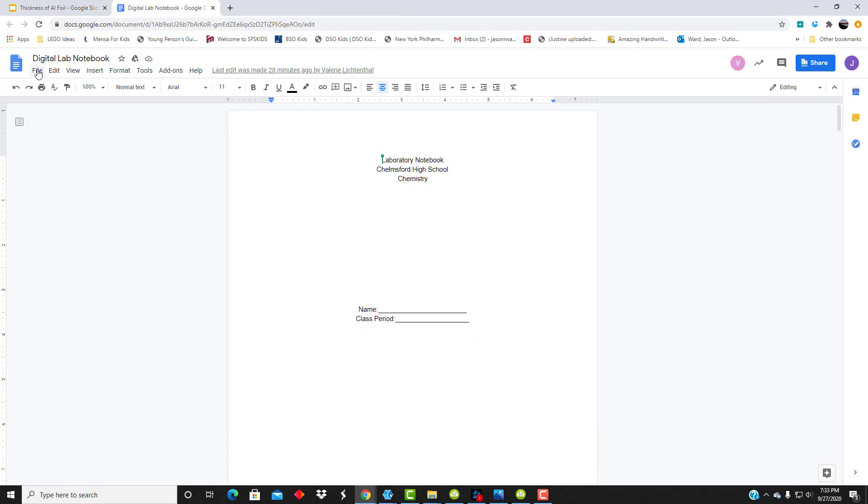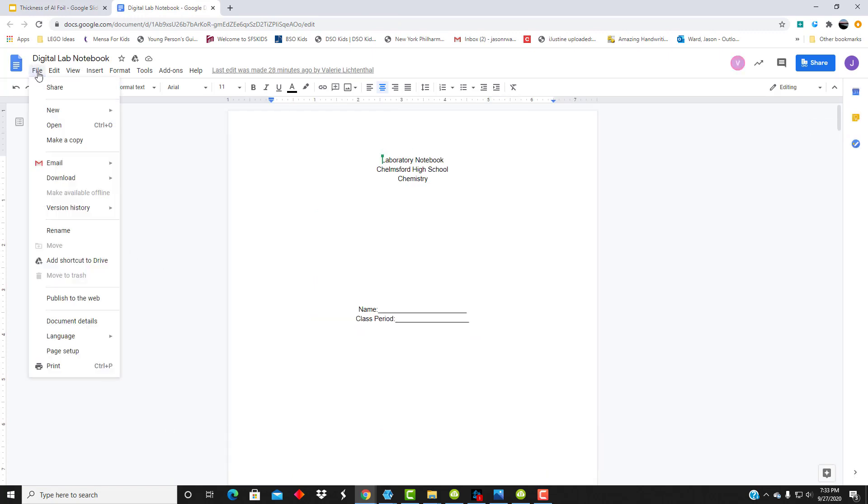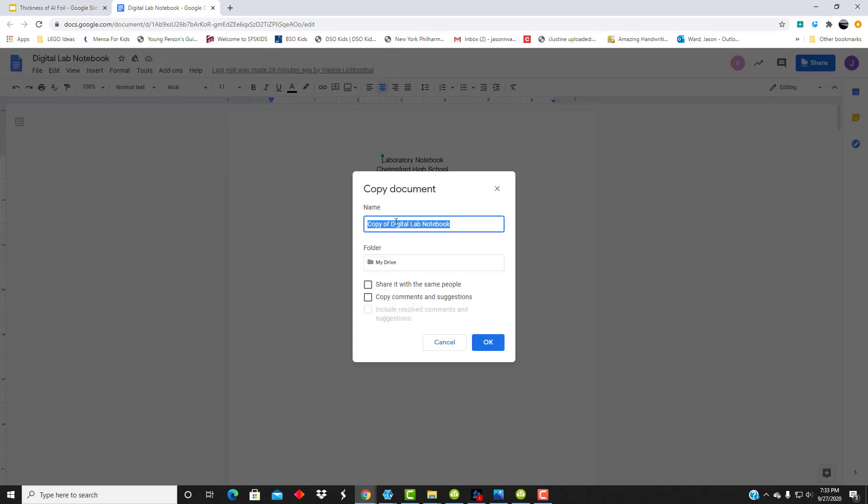The first thing you need to do, extremely important, is go to file, click on make a copy. So this way, you're creating your own lab notebook and not writing over someone else's.